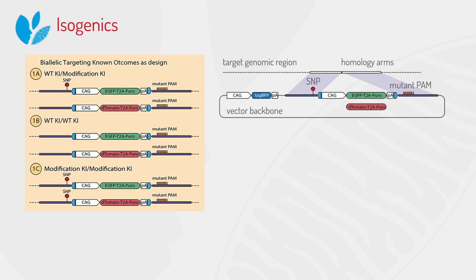And we do so by providing a DNA construct that not only carries a genetic mutation that we want to introduce, but also a fluorescent reporter that allows us to detect which were the cells that were correctly modified. By using different types of fluorescence, we can select those that present both events of modification. In this case, we're using a green fluorescent and a red fluorescent, so whenever we see that the cells are shining yellow under the microscope, this means that this cell has both copies modified at the same time.